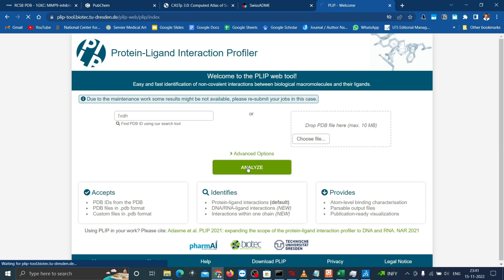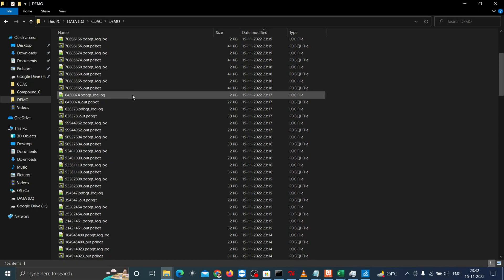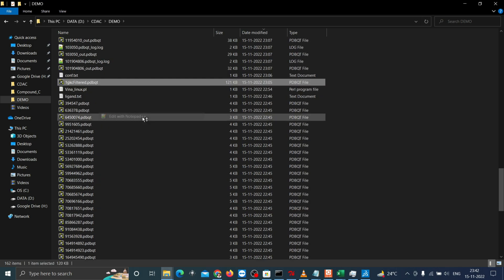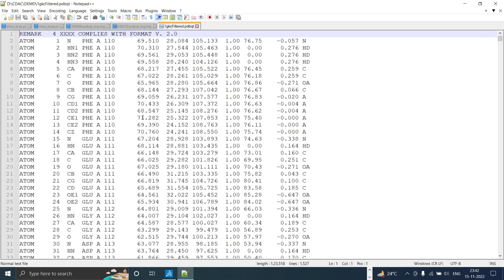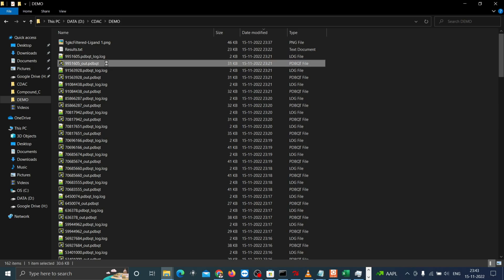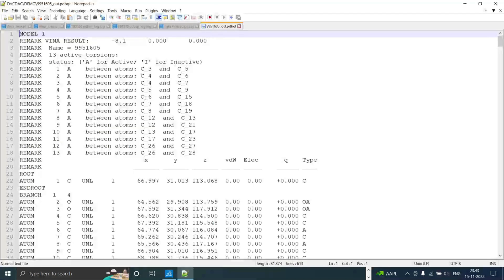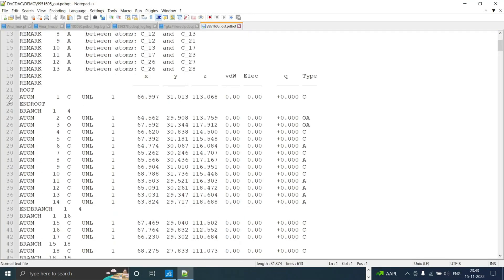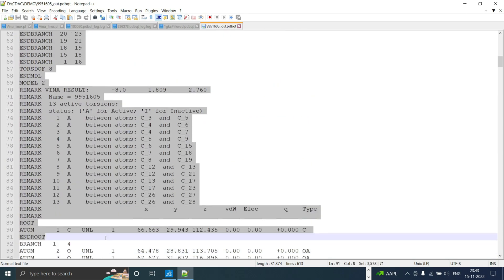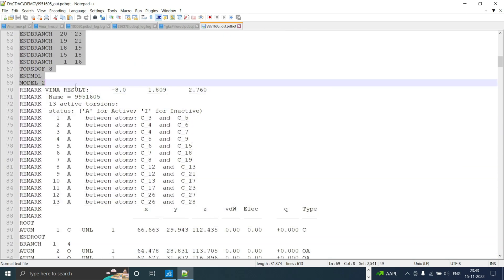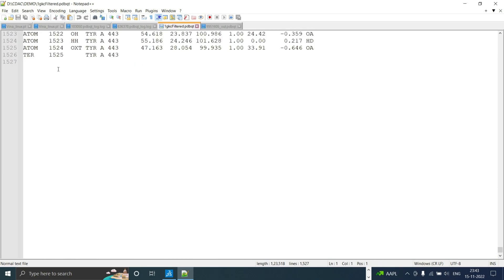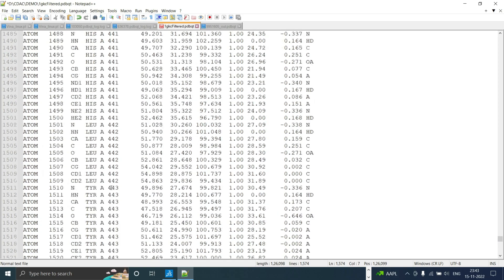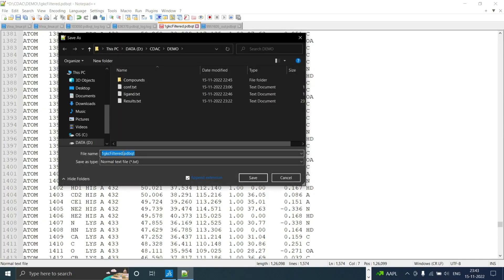Now you need a PDB complex to be made for the analysis. Go to the directory and open your receptor structure in PDBQT. Then open the docked output file which you want to make complex of structure. Copy the model 1 which had the higher affinity in the docking from root to end MDL. Now paste it in the end of the receptor and save it as a separate file named as complex.